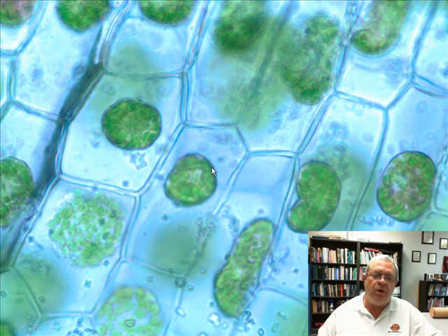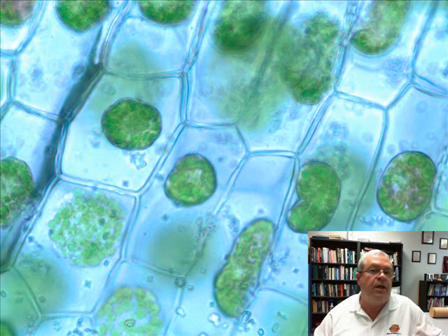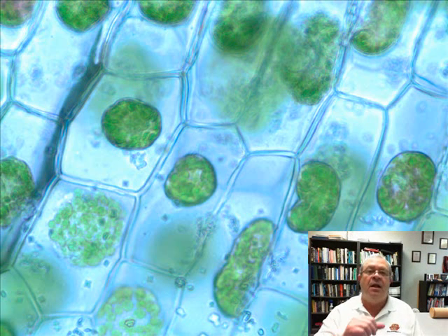And what is the boundary around this small little area? It's called the plasma membrane. Unhappy situation for this plant cell. Where's the plasma membrane supposed to be? Or at least in a happy plant cell, pressed against the inside of the cell wall, is it not? And so these cells are what? Hydrated or dehydrated? Very definitely dehydrated.